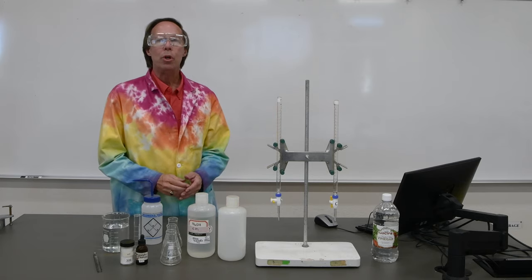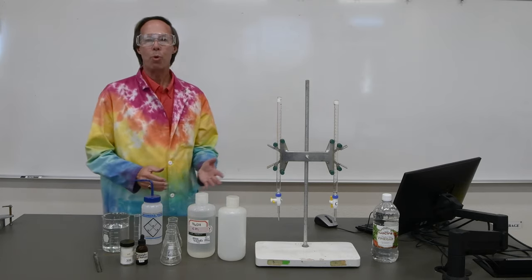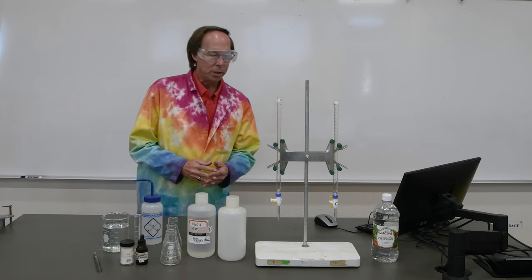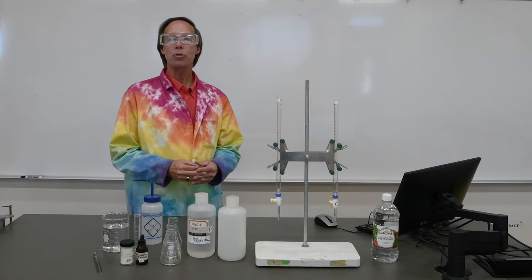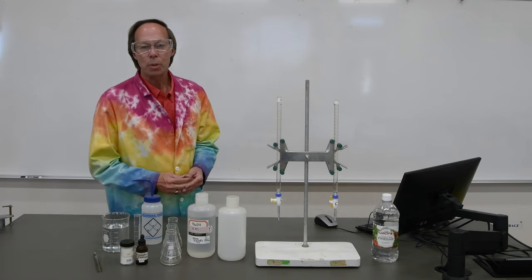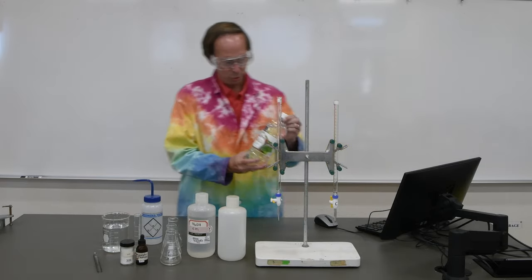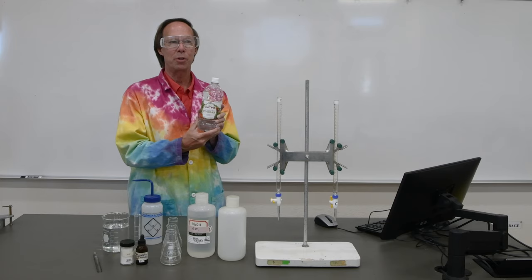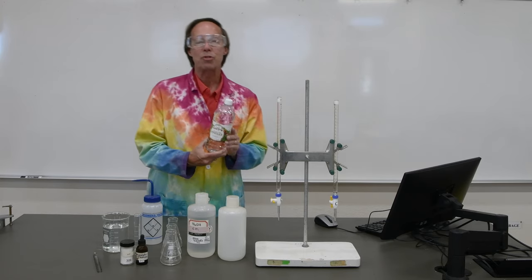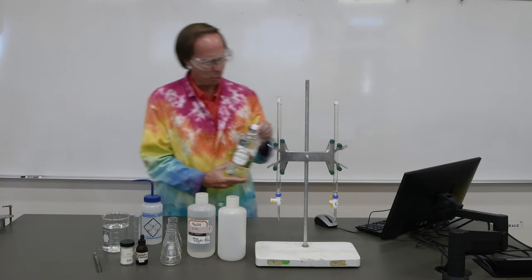Earlier in the semester, we carried out a titration between a sample of hard water and EDTA. Today we're going to be doing another titration experiment, and this is a more common one called an acid-base titration. So we're going to be taking a sample of an acid which has an unknown concentration. That's going to be vinegar. Vinegar contains approximately 5% acetic acid, but we're going to try to determine more precisely that value.